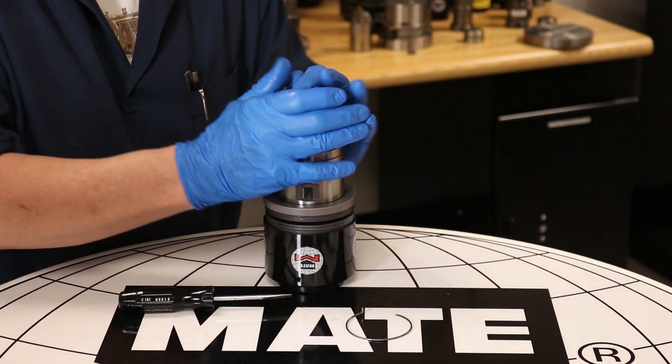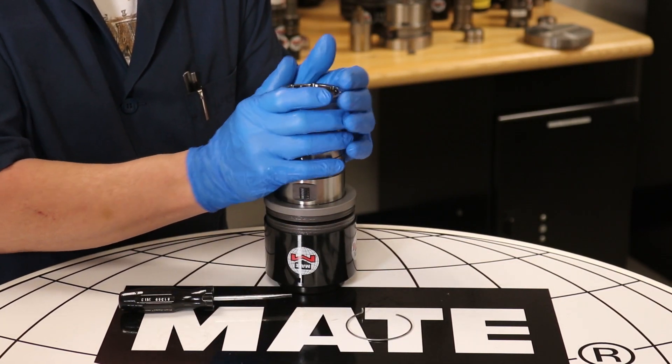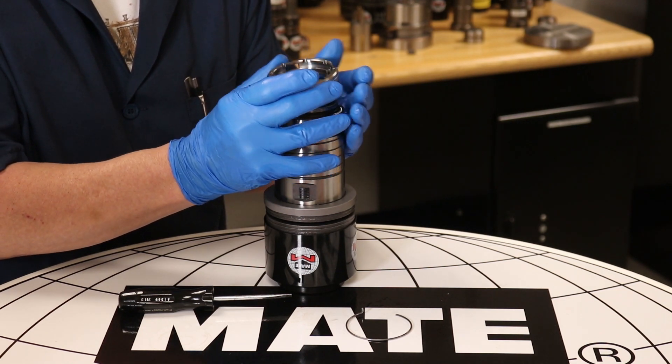Now we can remove the lock ring. While keeping pressure on the lock ring, push down and rotate clockwise to remove.